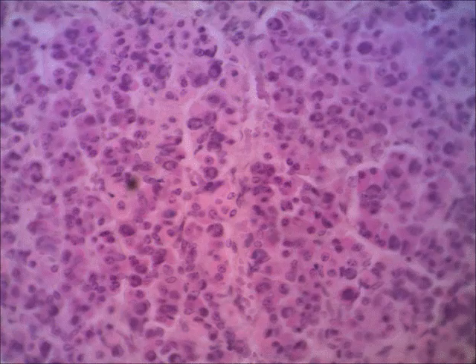If we move up to a high power magnification, here you can see the anterior lobe, and in your lab manual, it says to notice some cells that have pink staining granules. That's what you're seeing here and here. These are called acidophil cells. The dark purple that you see is the nucleus of each cell, but the pink area that your book is referring to is the cytoplasm. It's because of the pH of the granules that makes it stain pink. Of course, it's not pink in its natural state.